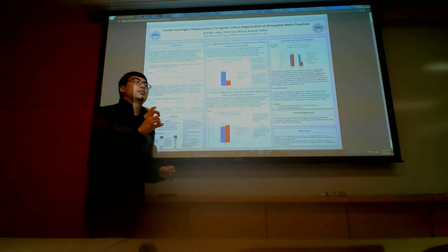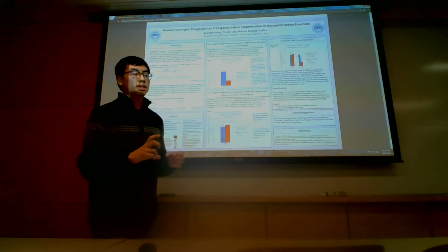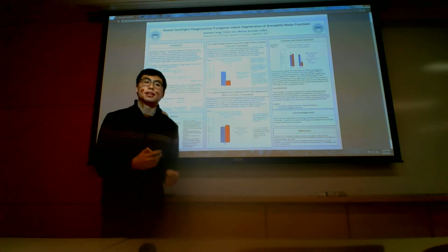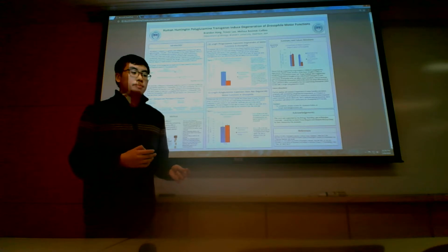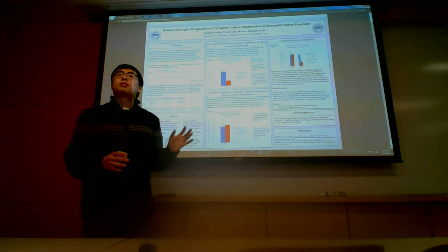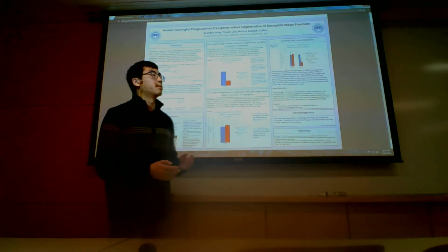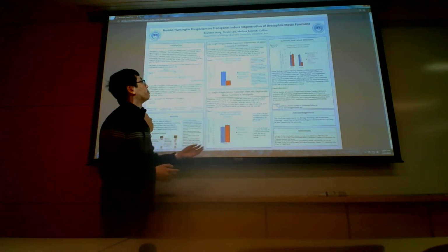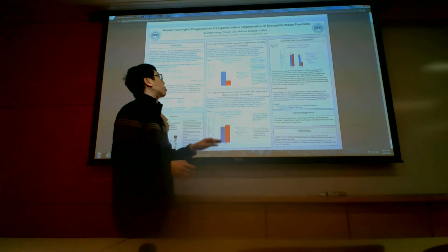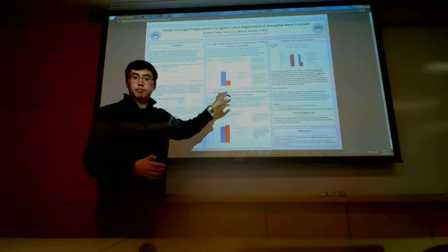We counted 30 seconds using a video recorder, and counted the number of flies that migrated 8 centimeters in 30 seconds. We calculated a percentage for that replicate. As I said before, we have 2 replicates, so we averaged the percentages together to get the data shown here. As you can see, polyQ128 expression shows a dramatic decrease in motor functions when compared to that of the control.